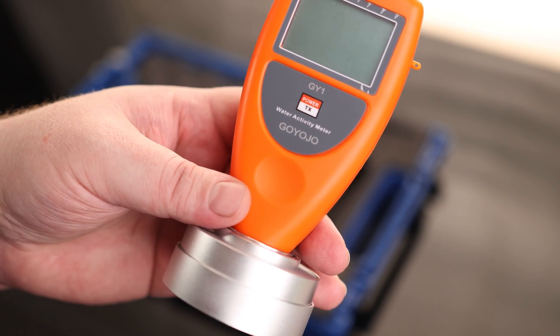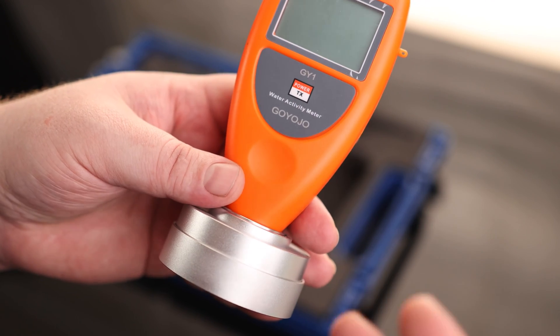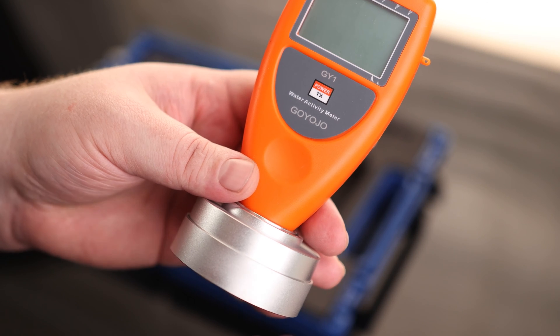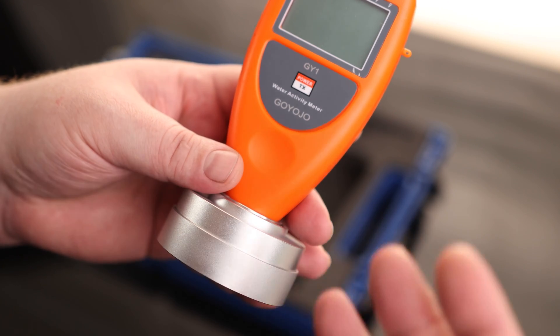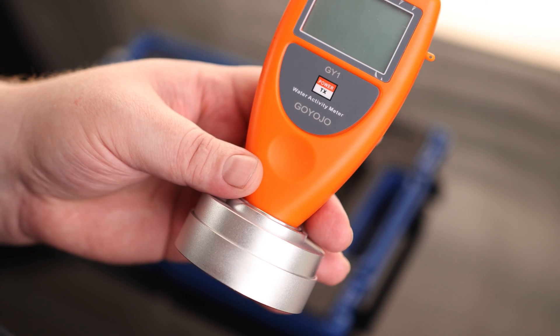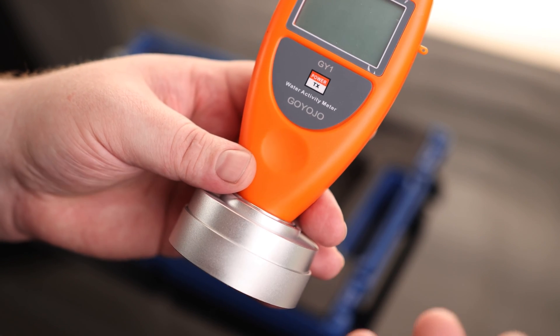Water activity is a different thing than water content. Water content is just overall water and that includes water that is already bound to the product. Water activity is going to measure unbound water, or water energy — water that's available for microbial growth. So this is going to be a much more useful tool if you're trying to find out if your product is going to be able to grow mold.